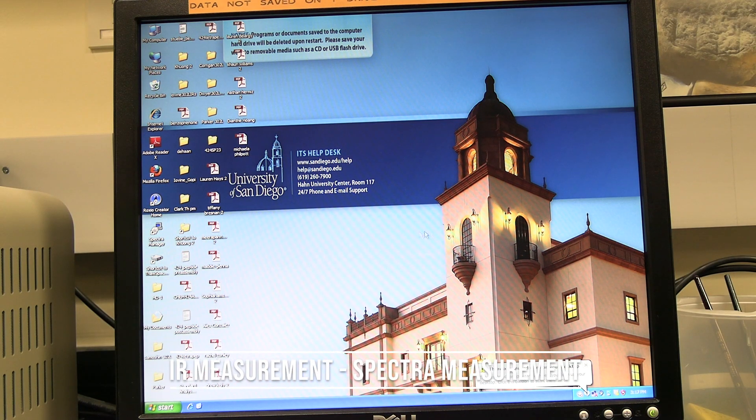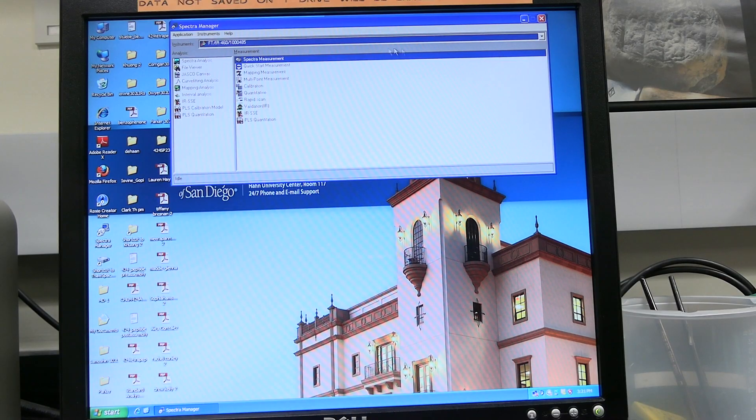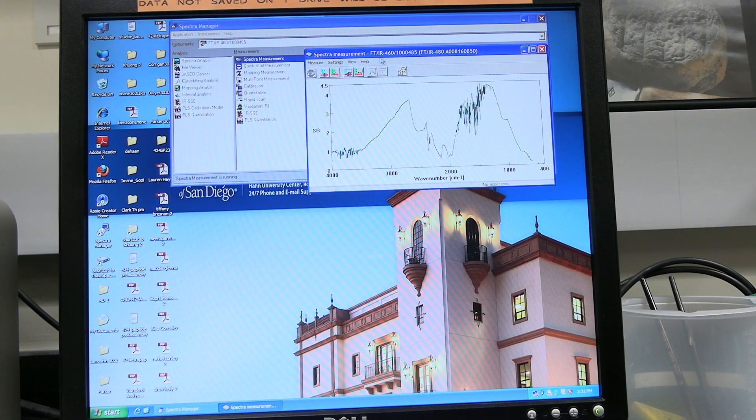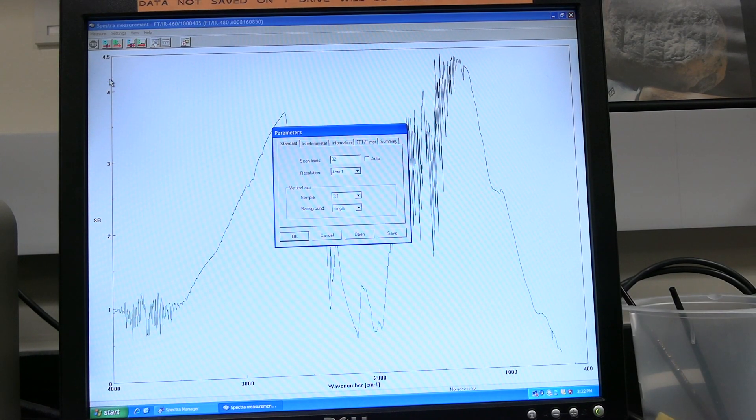IR measurement. Spectra measurement. Click on the spectra manager icon. Click on spectra measurement. Expand the spectra measurement window if needed. Click on measure and then on parameters. In the standard tab, set scan times for the number of scans. Set resolution.